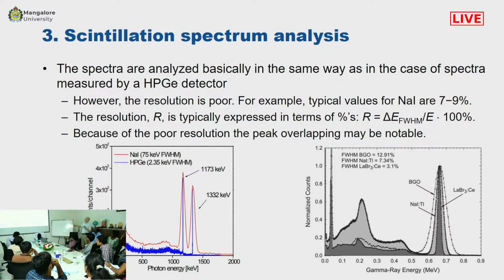And the problem is that peak overlapping may be notable. So there is a comparison for sodium iodide and high purity germanium.